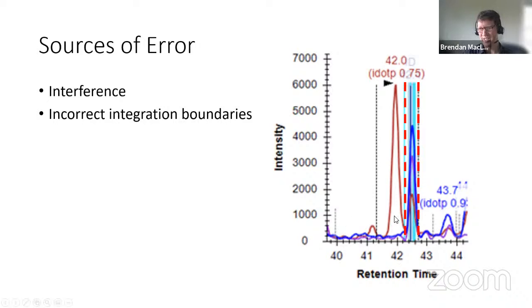And I'm going to tell you that there's still going to be interference on this brown thing. It's not completely gone. So we're still getting signal from something else, but we're getting a lot less of it than we were before. To get the most accurate quantification, we might want to eliminate this brown thing from our quantitative considerations, because there's obviously some other peptide that contributes signal to it.